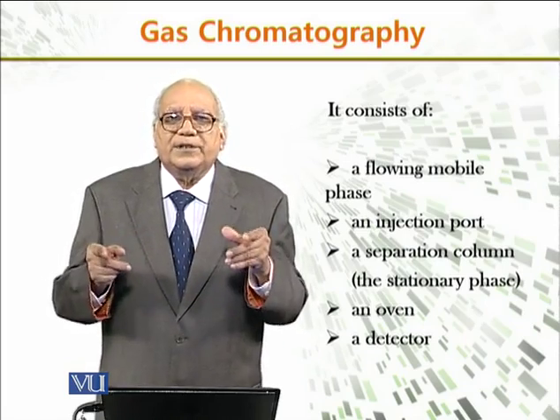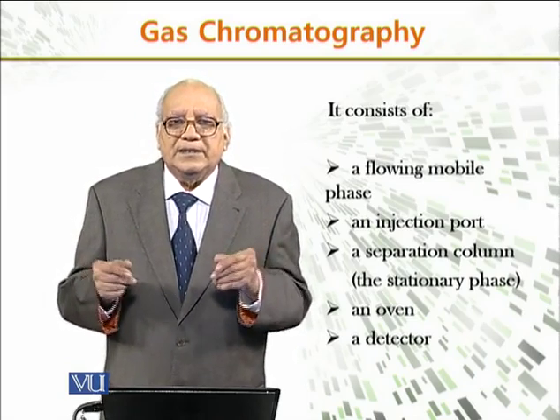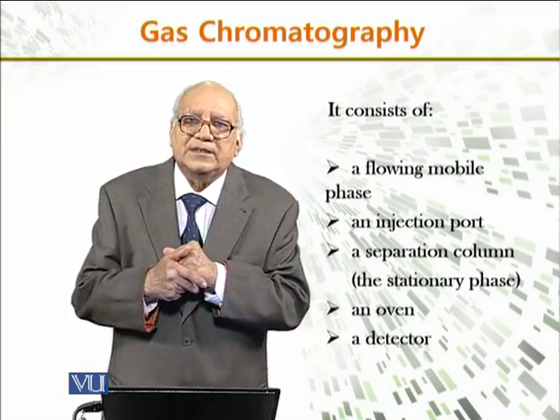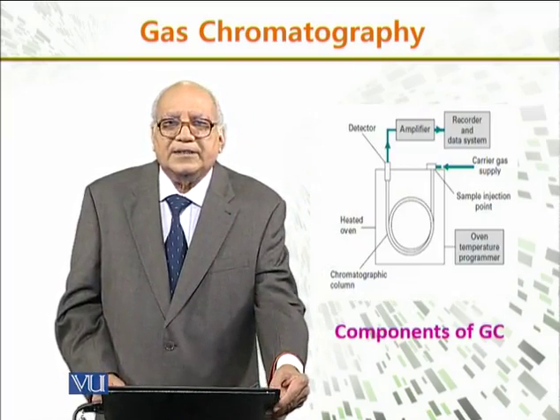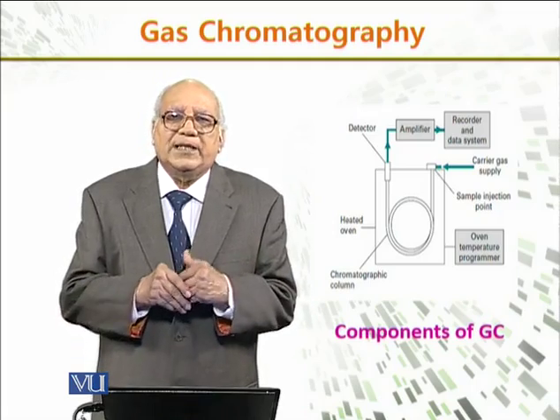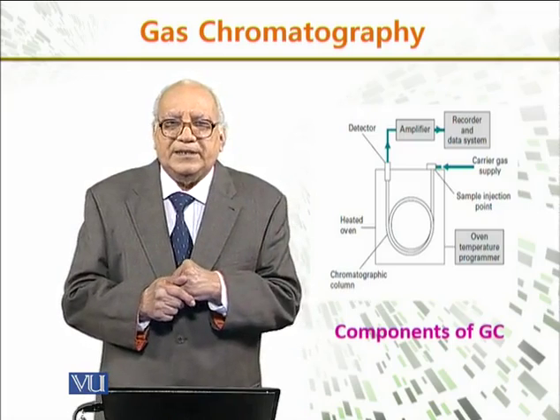This whole thing is put in an oven for temperature control, and then there are detectors which detect the material which comes out of the column and indicate this.